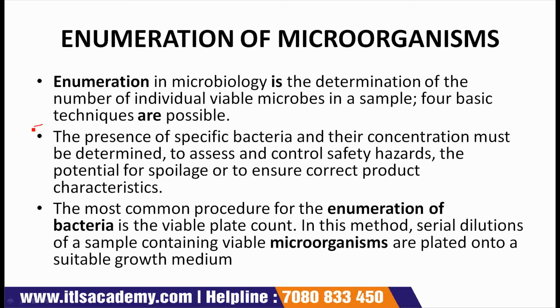Next point is, the presence of specific bacteria and their concentration must be determined to assess and control safety hazards, the potential for spoilage, or to ensure correct product characteristics.